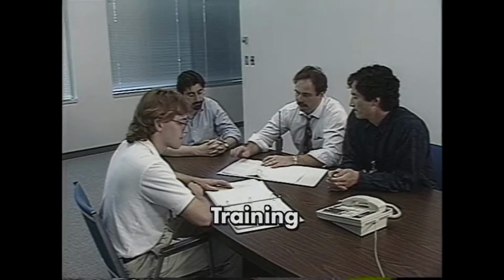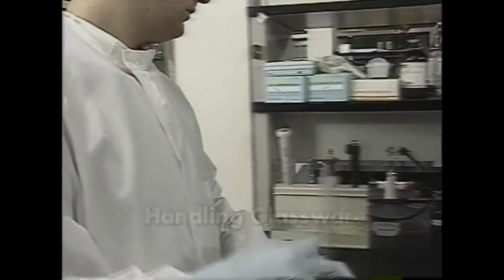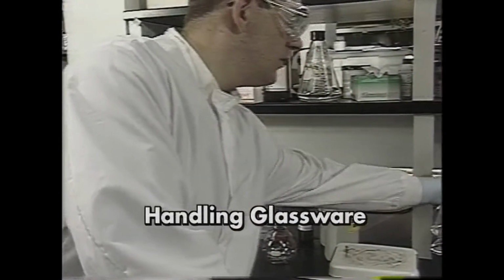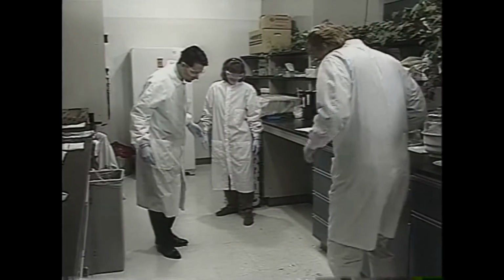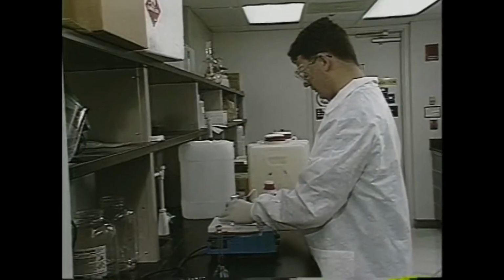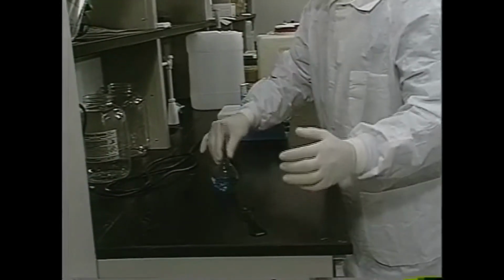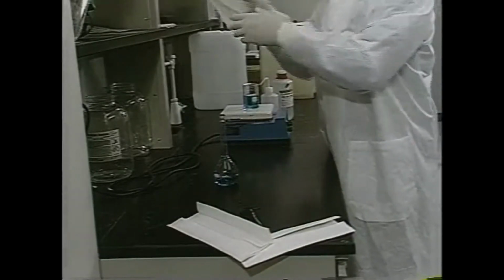Training is also a key part of being able to work with chemicals safely. A training schedule and other details of your facility's chemical safety training program are included in the chemical hygiene plan as well. Learning to handle glassware safely is particularly important because improper handling of glassware is the leading cause of accidents in the lab. When hazardous chemicals are involved, little accidents can develop into significant exposure situations. So we have to work safely from the start.